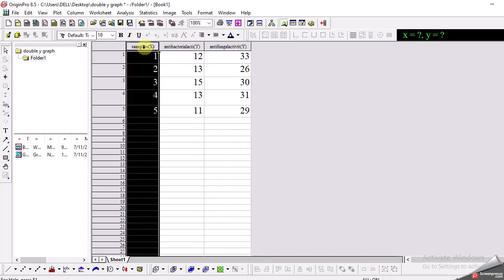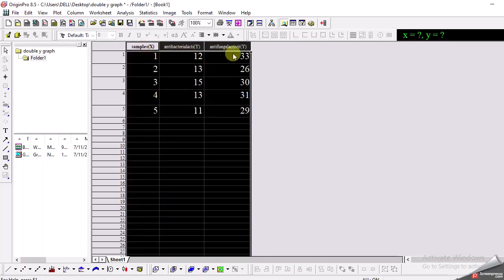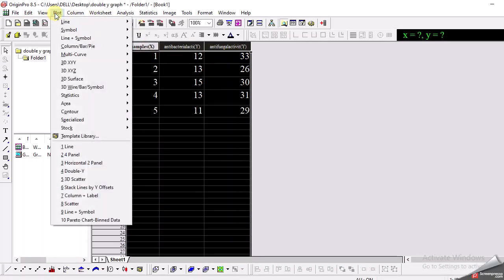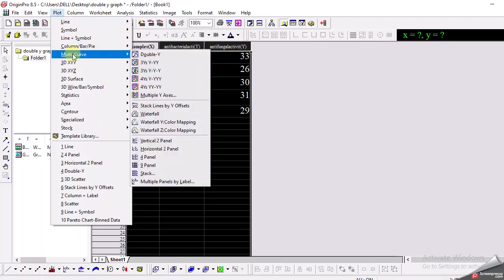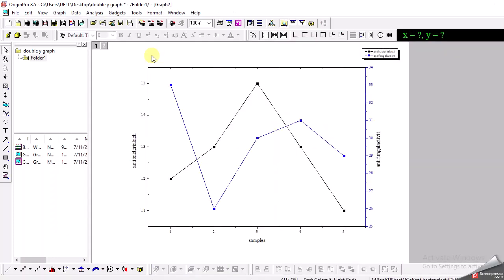Now I select all these columns and all this data and I go to plot and then I go to multi-curve and here we have an option of double y graph. So I click it and here it is.